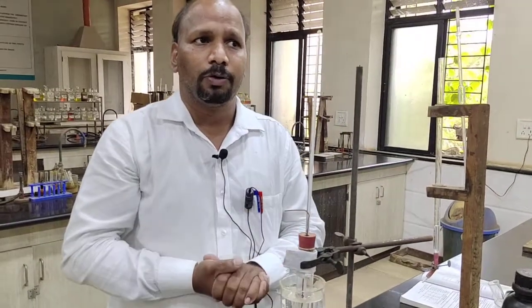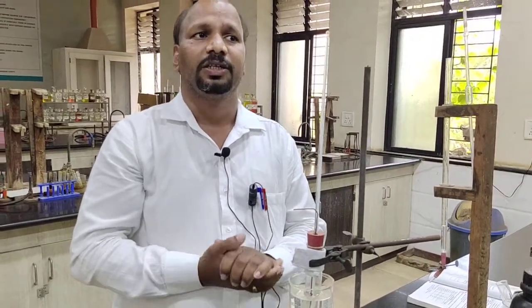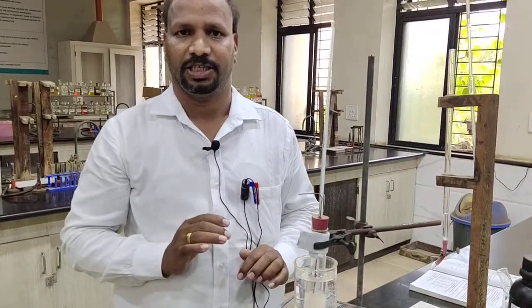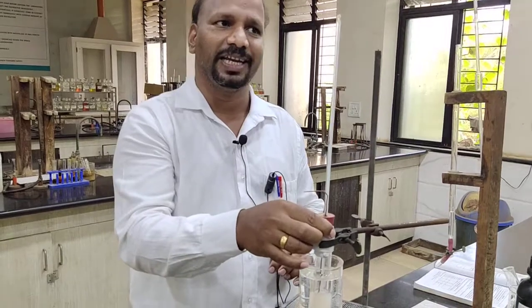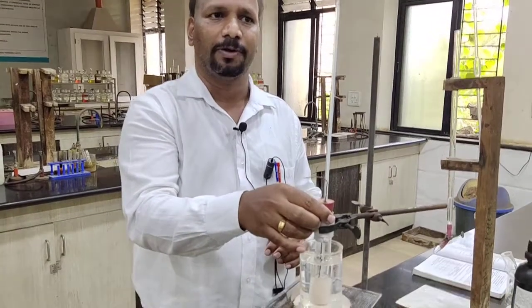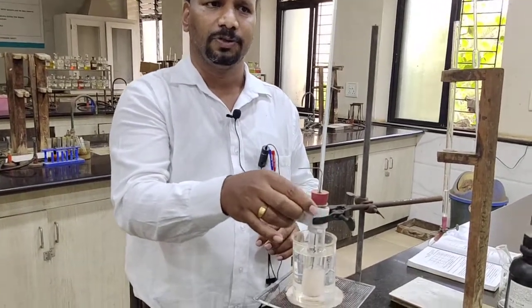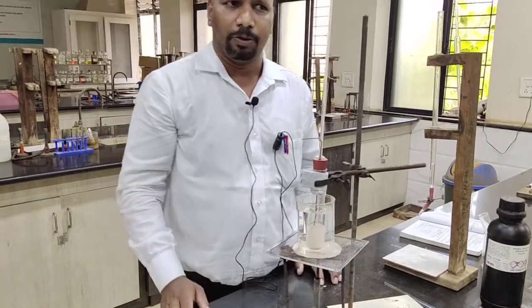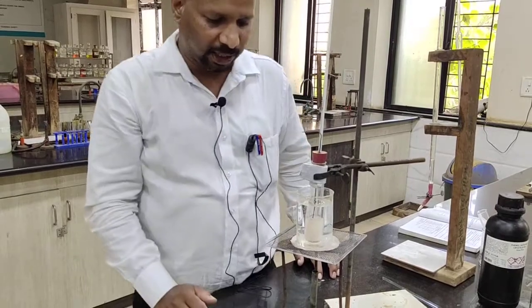So what we are going to do is decrease the percentage of phenol in the system, because initially it was 10 gram of phenol. If we want to find out the percentage of phenol, there is a simple formula. That part will be explained by Professor Kale sir.